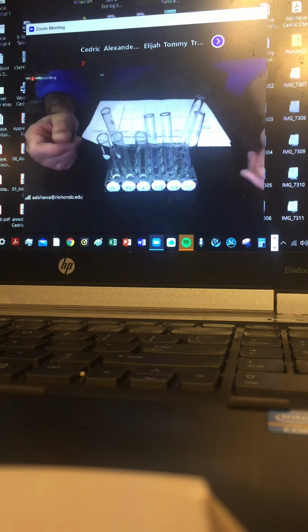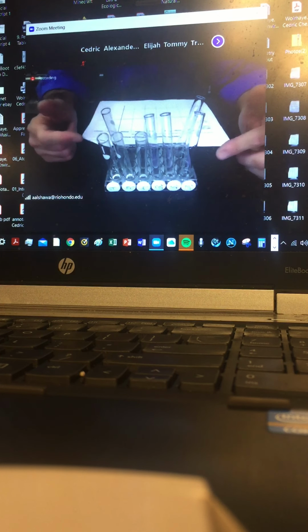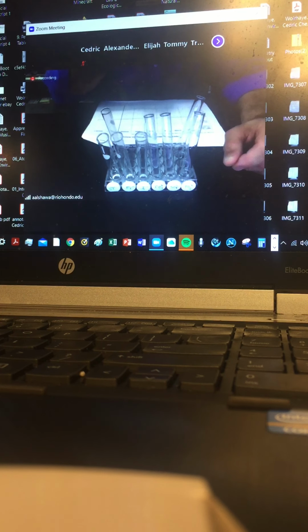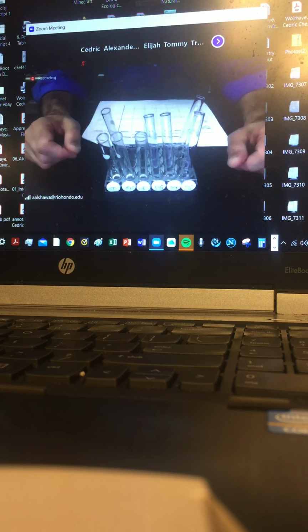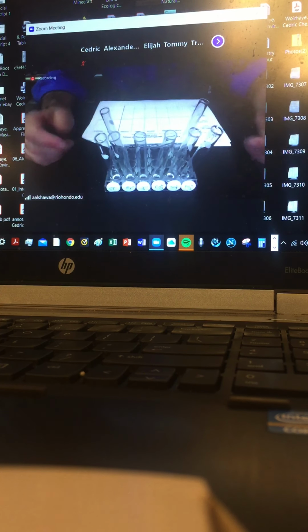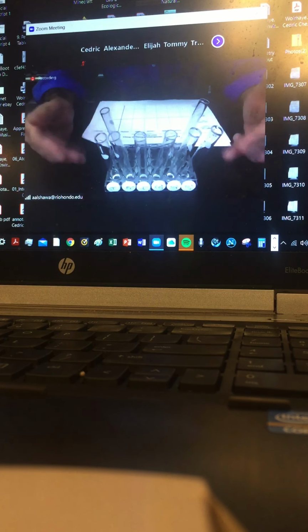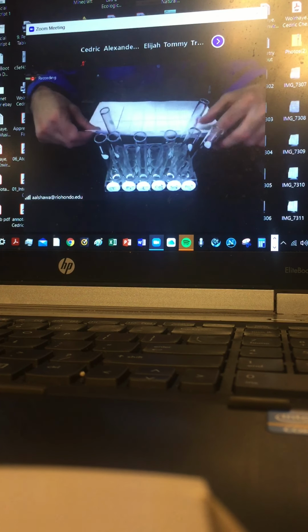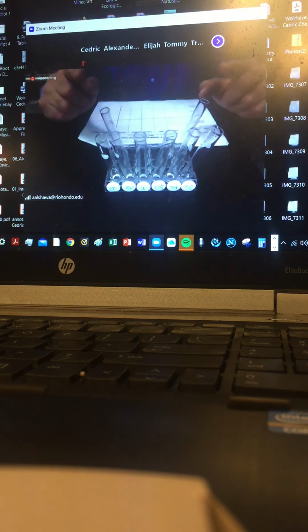So typically, generically, we have two students partner together and share their resources of drawers and glassware, because it's not suitable for one student. Otherwise, you're going to end up all day long just cleaning, drying, trying to come up with all these 3 tests. So I'll do the same.